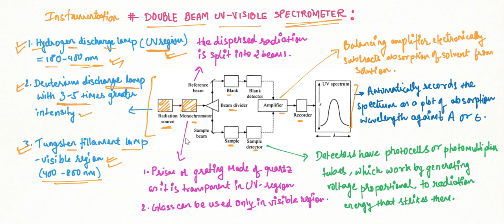Okay, so the monochromator basically consists of a prism or grating which continuously disperses the radiation, and it is going to give us a particular wavelength of radiation. So it is basically dispersing the radiation to give us a single wavelength. All right, and what is it made of?